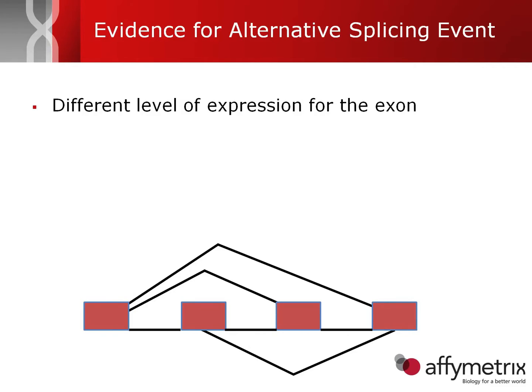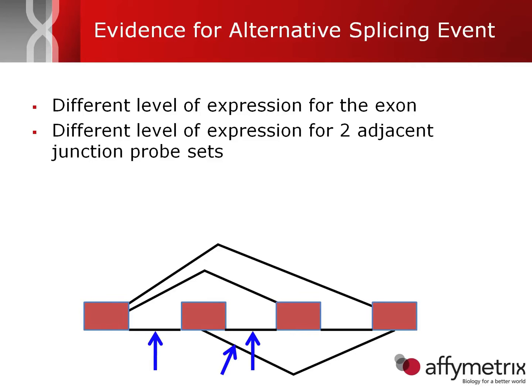What you can expect to see is something like this. You can look at the differential expression of the exon itself, because if the exon goes in or out, that exon expression level will change. In addition, you can look at the different levels of expression for the adjacent probesets, or adjacent adapters. In this case, these connect the exon to the surrounding exons, and at least two of those should also move in the same direction as the exon itself.